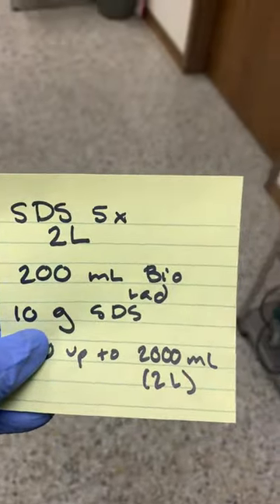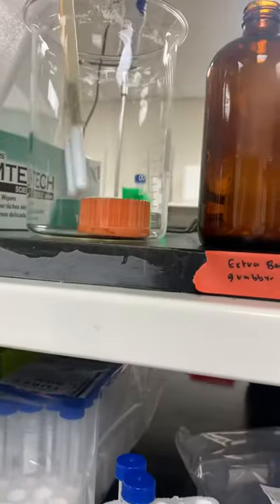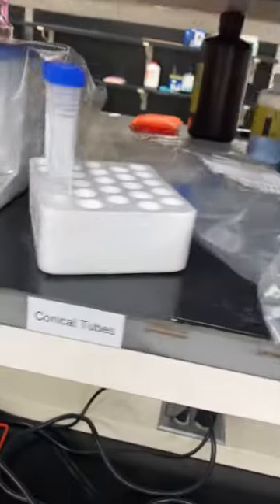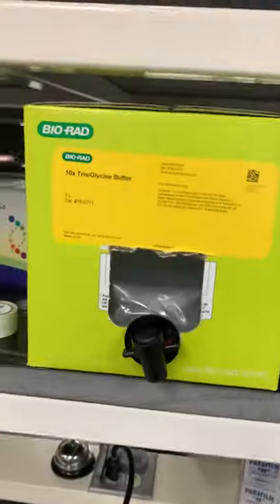Hey everybody, today we're making SDS-PAGE. So we need to grab our funnel, which will always be up here, one of our stir bars. Right now we have two. And then our Bio-Rad, which is right there — it's already in my container, 200 milliliters. Our other stir plate is busy so we have to go on a little walk.